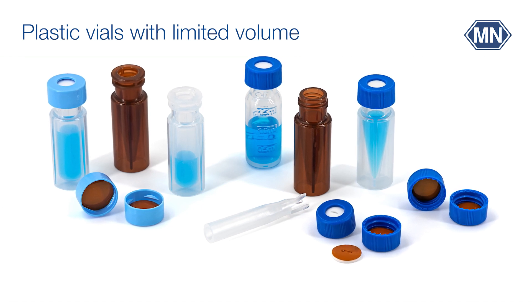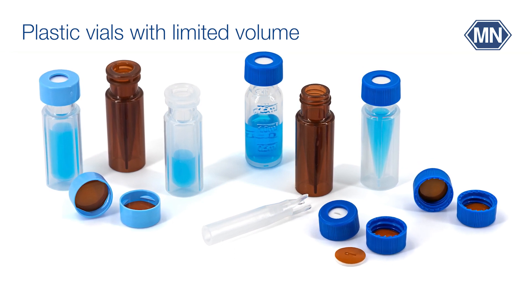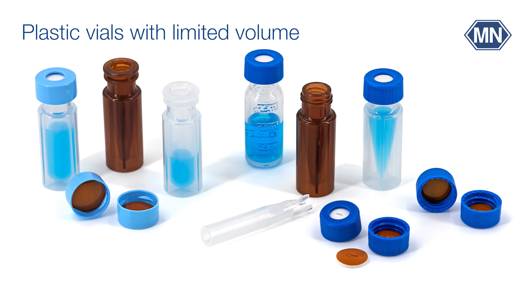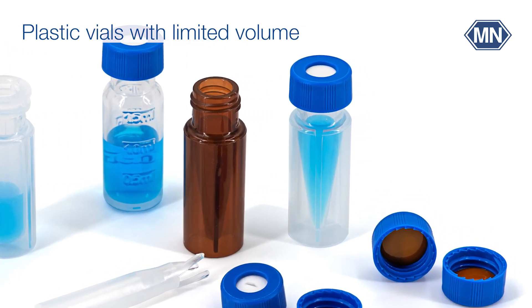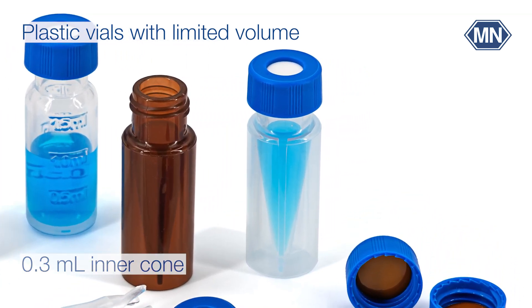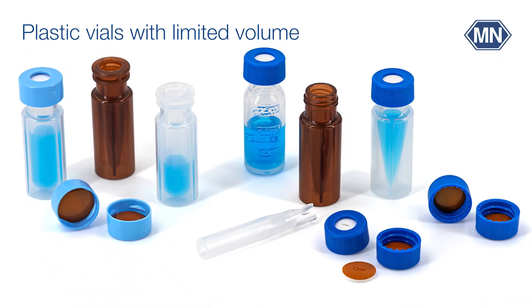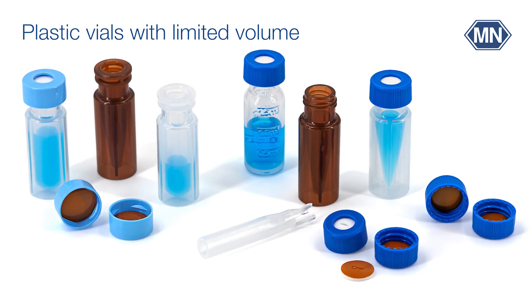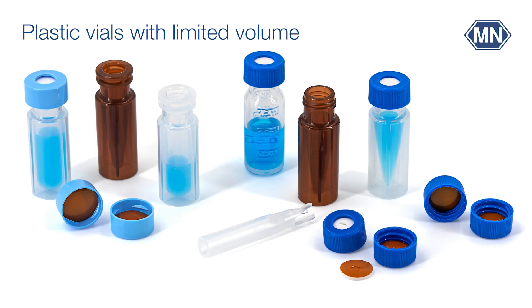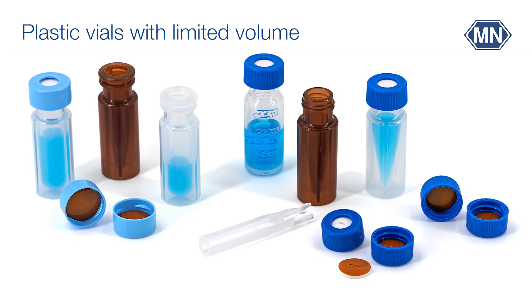Plastic vials with limited volume are available for special applications like heavy metal analysis, ion chromatography, and PFAS analysis. These limited-volume polypropylene vials come either with an injection-molded 0.3 milliliter inner cone or a 0.7 milliliter round bottom insert. In contrast to glass, plastic vials have low adsorption effects on polar substances and contain no heavy metals; however, they are less inert to aggressive samples or solvents.